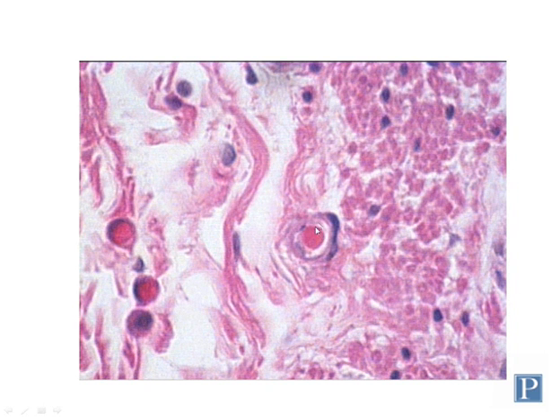Capillaries are essentially composed of endothelial cells, and you can see the nuclei of those endothelial cells are darker, more basophilic structures, and there are also associated pericytes which have their nuclei a little bit more to the side, such as the cell right here.